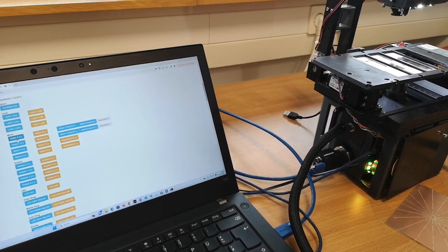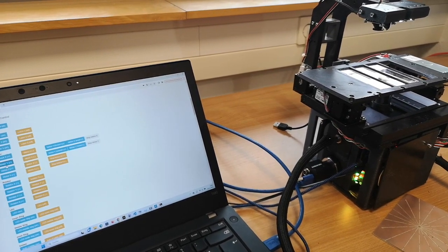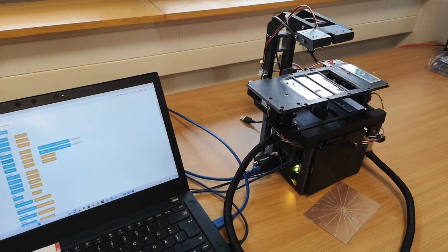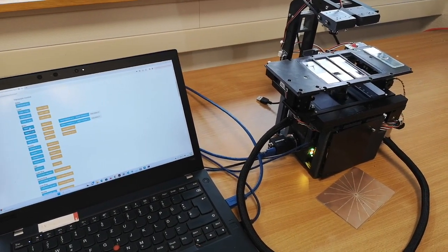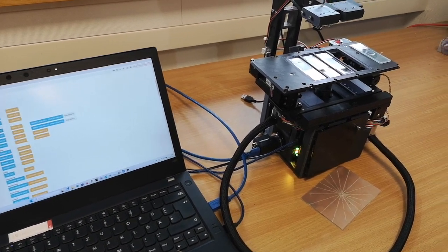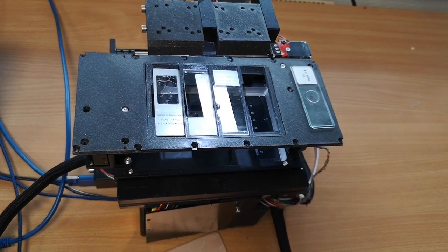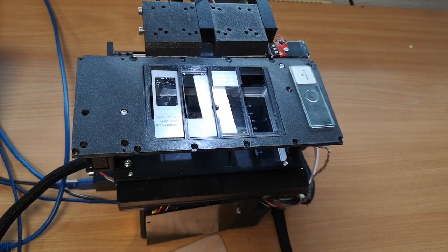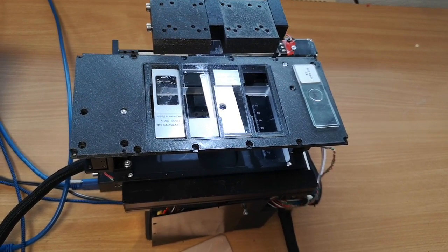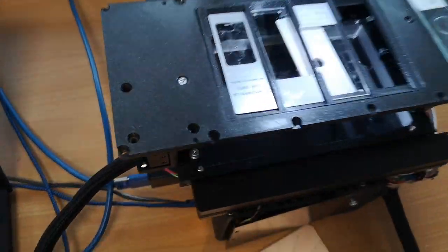So we'll turn on the LED here now, and then you can move the stage, for example, along the plus X direction or along the plus Y direction. And this is now how it should operate. So here you have the X direction. So looking from above, this is then the X direction, minus and plus. And this is the Y direction. So it moves along this direction.